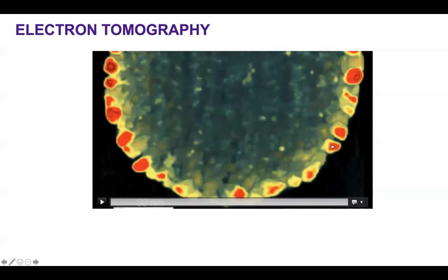In this case, you can see that the high contrast area is a gold core. It's a cross-sectional view showing a one-layered shell. And then we have less contrast organic material. And this sphere is encapsulating some of the unreacted organic material inside.